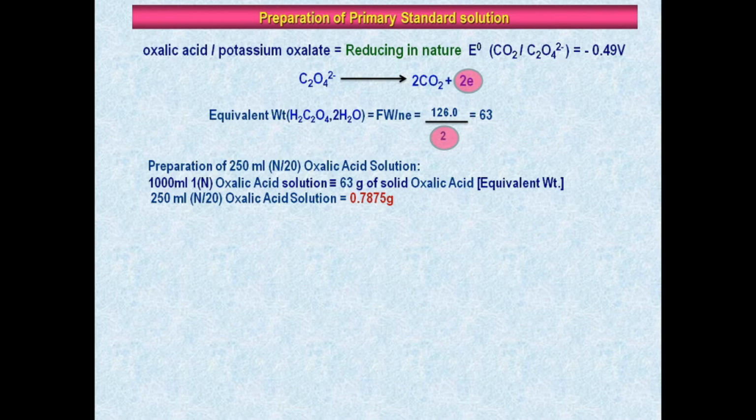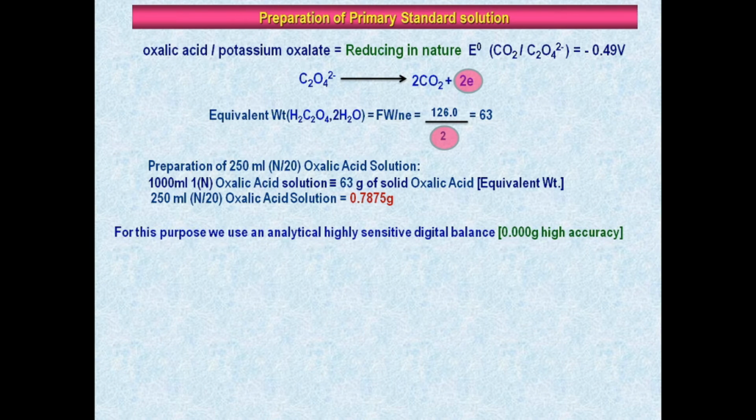Again, for this purpose, since it is a primary standard solution, we have to use a highly sensitive analytical digital balance with high accuracy. In this case, we follow the weight transfer method for taking almost the exact oxalic acid as required.